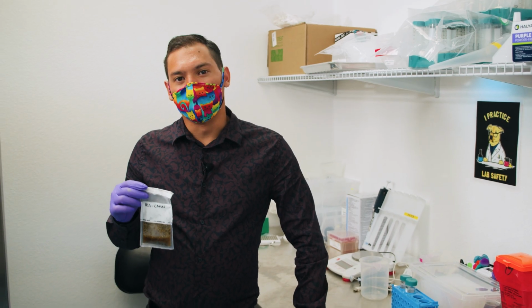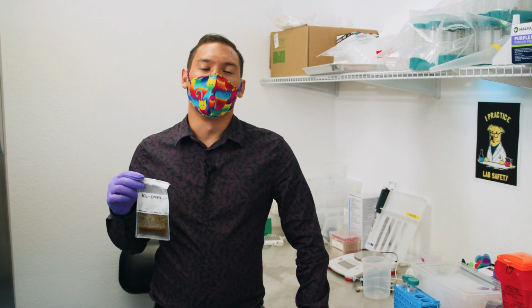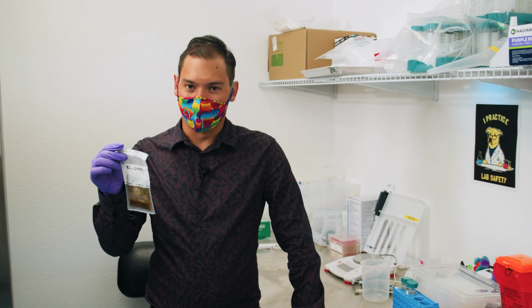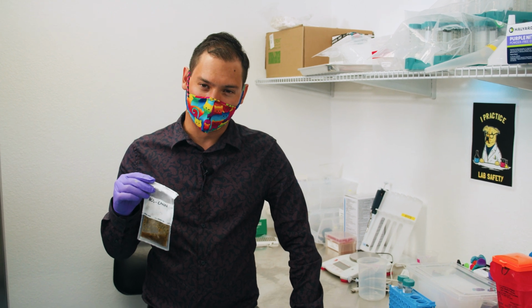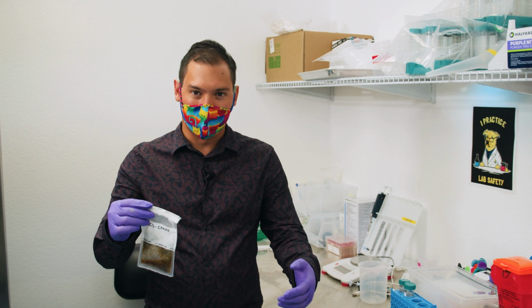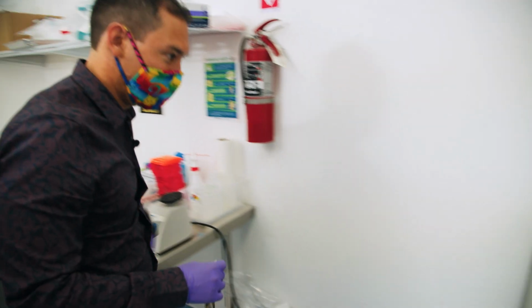So once our sample is in the tryptic soy broth, it's going to be important to place it in the incubator for what we call enrichment. Enrichment is going to be important because if you consider contamination in a cannabis sample, sometimes there's a very small amount of microbial contaminant in there. So if you're searching for a needle in a haystack, why wouldn't you let those cells grow and multiply so that when you subsample, you can actually hit the target if it's present? So I'm going to go ahead and place this in the incubator.